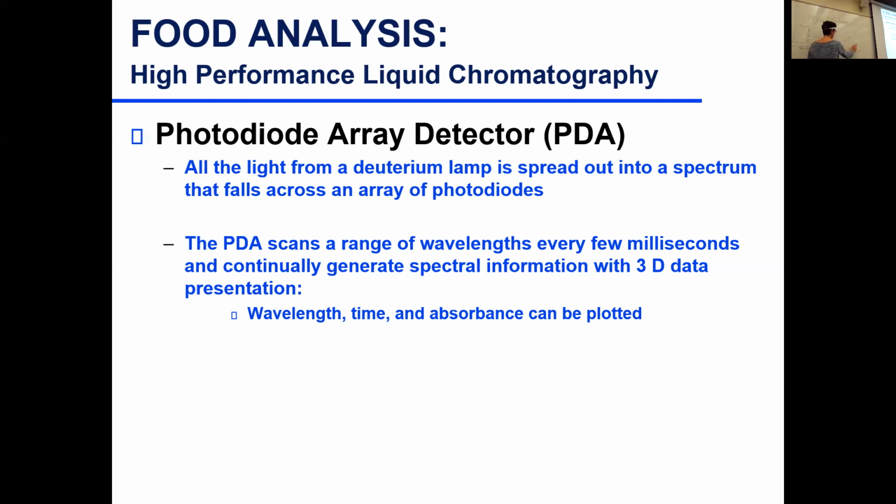So it gives me the range of lambda where caffeine absorbs light. So I can use retention time and spectra to identify that this is caffeine. When we did our coffee sample and we saw so many peaks close to the caffeine, we used the spectra to identify which one was caffeine, because they all were eluting close to each other.